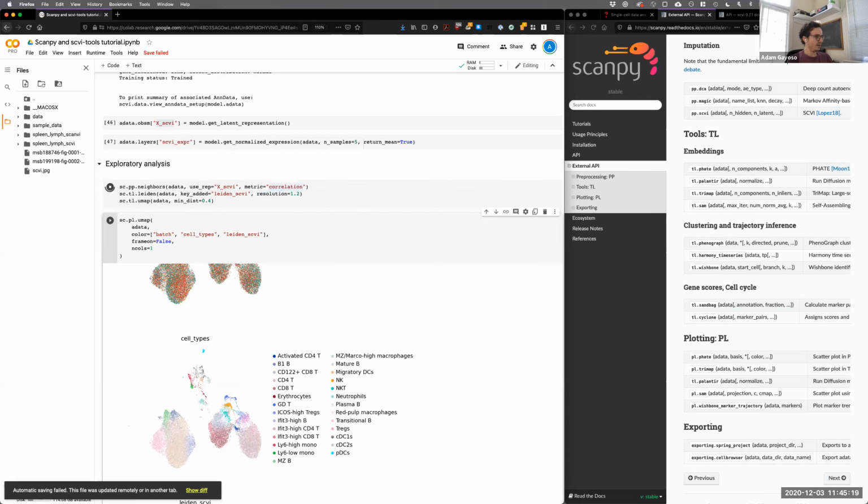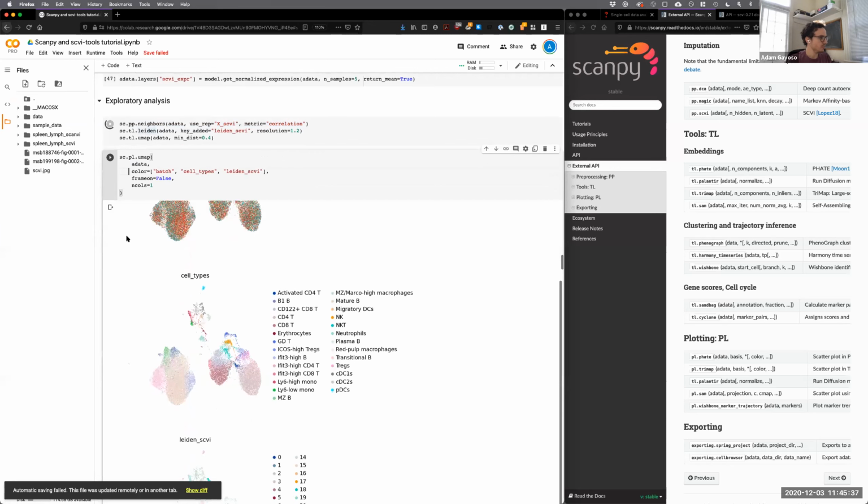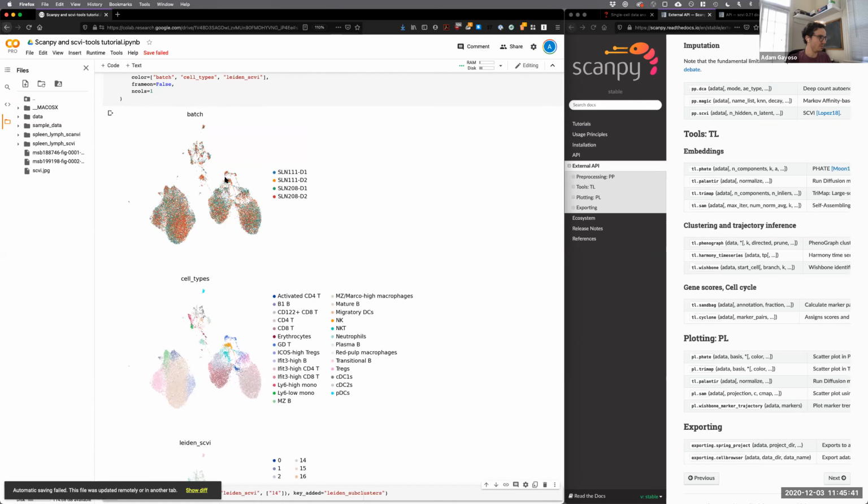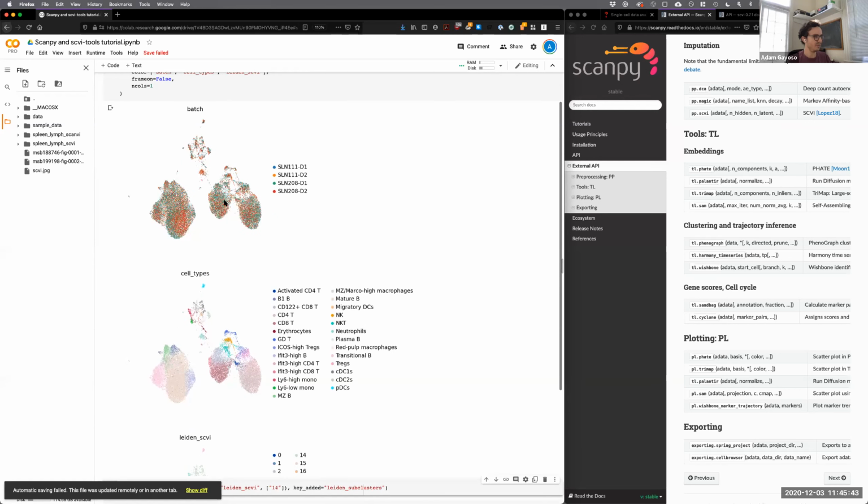So I'm going to run that. I'm also going to, this is how you cluster with Scanpy. It's called sc.tools.Leiden clustering, and it uses the neighbor graph that gets stored after this method. Once that's done, I'm going to plot the UMAP with, well, you can already see it here, but this is going to reappear.